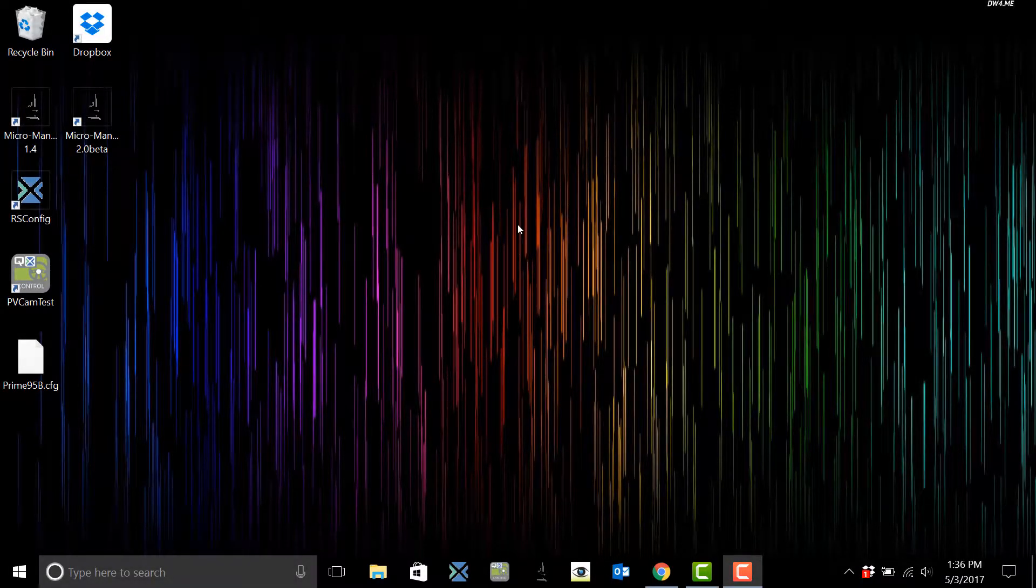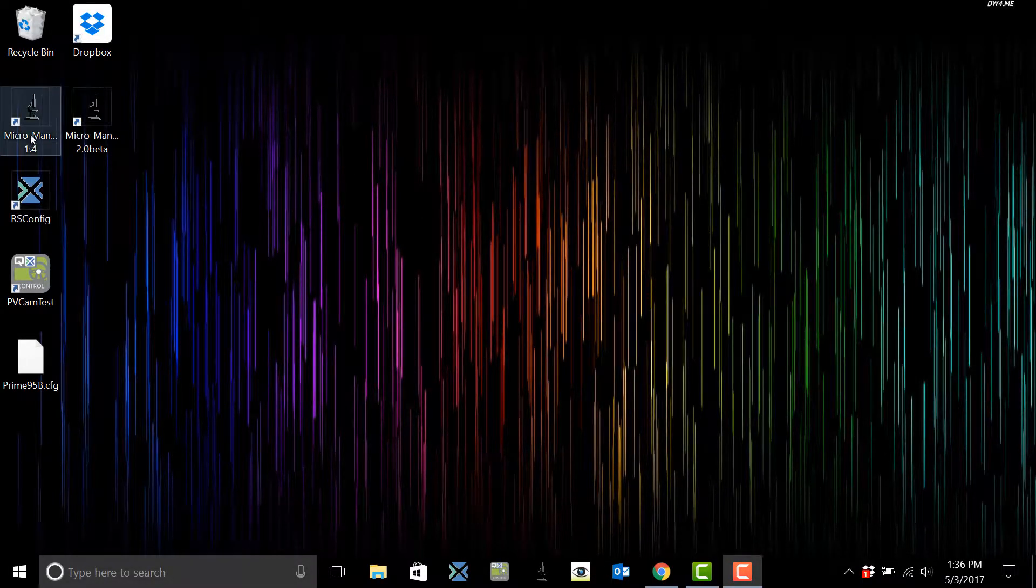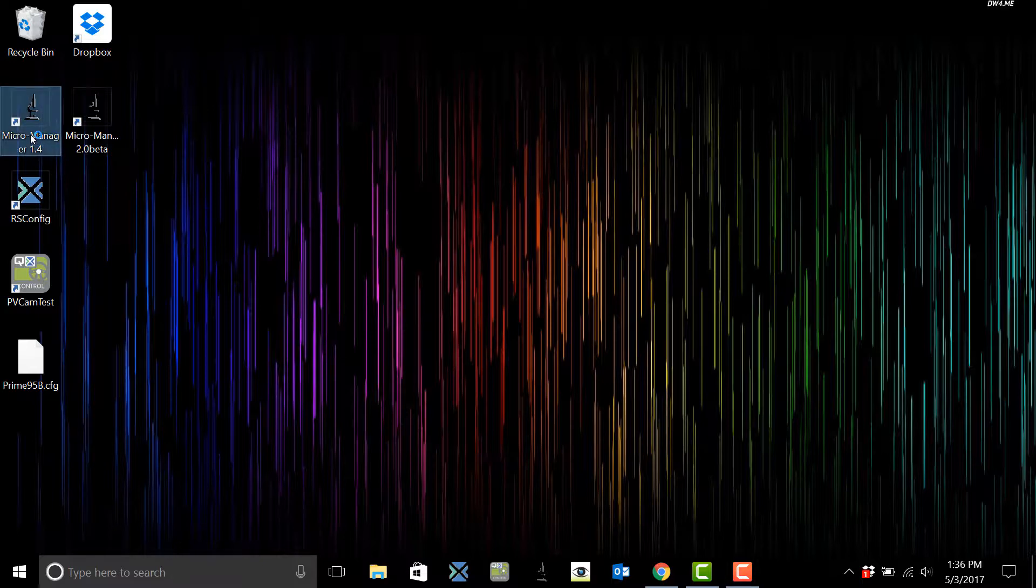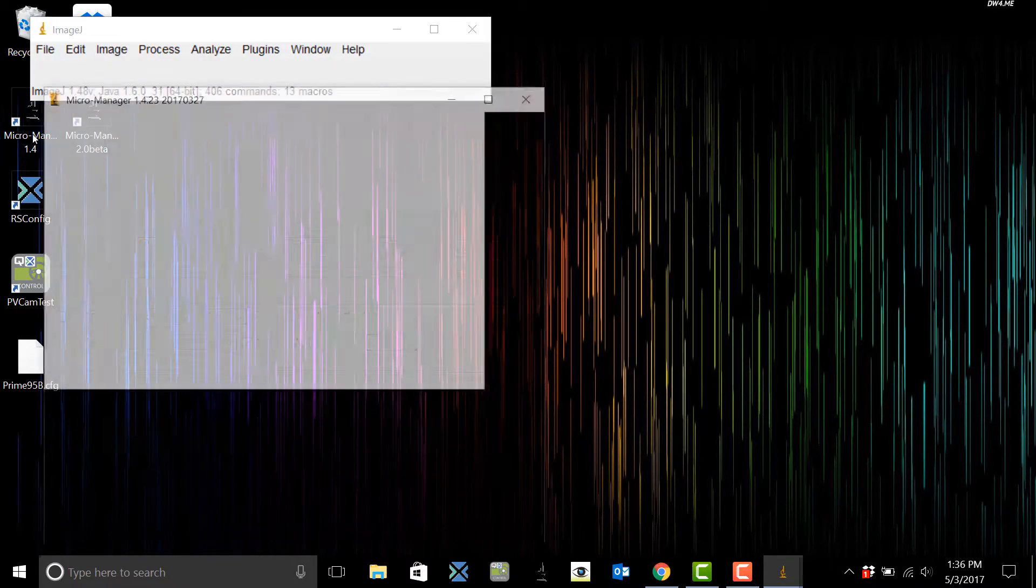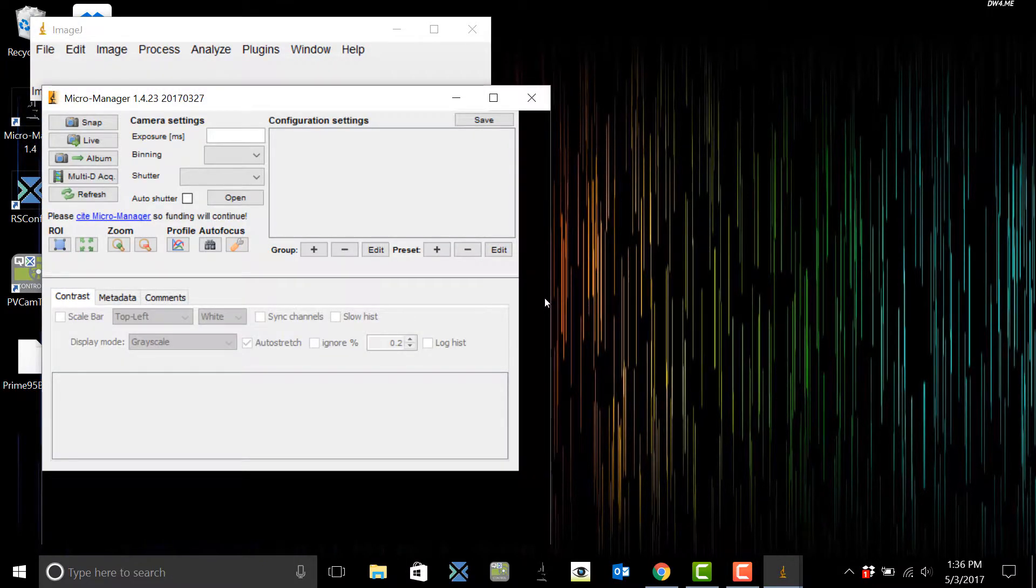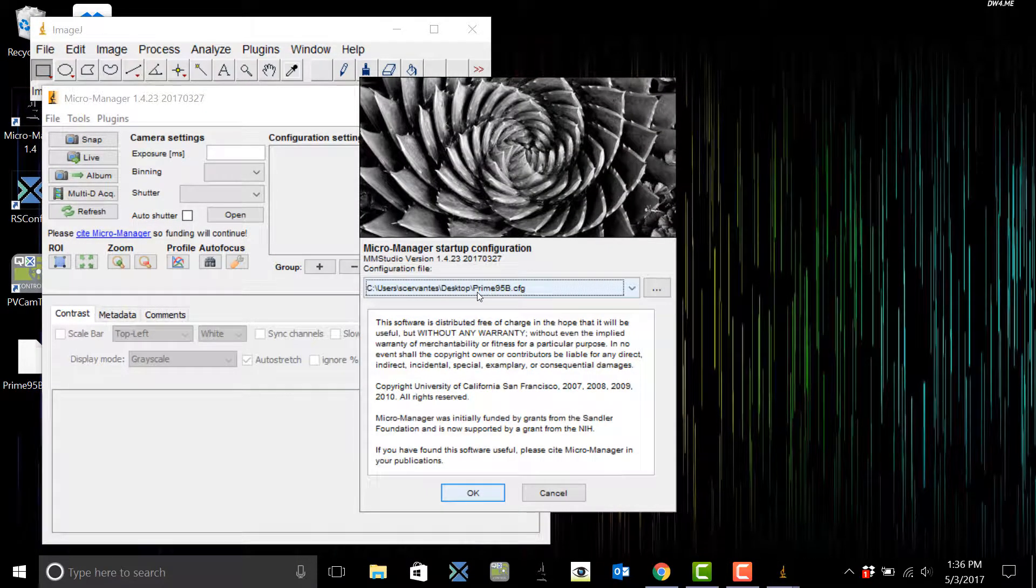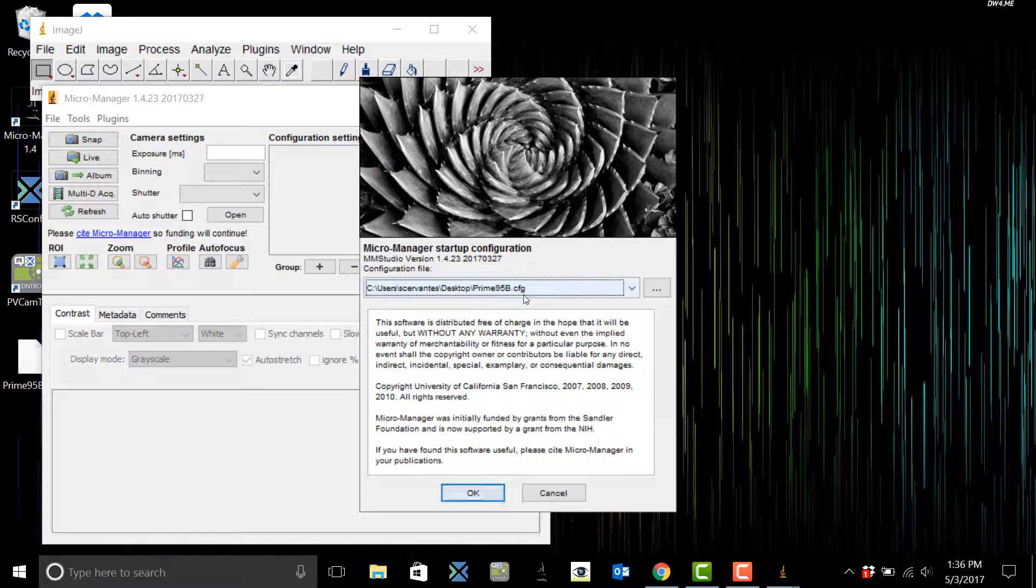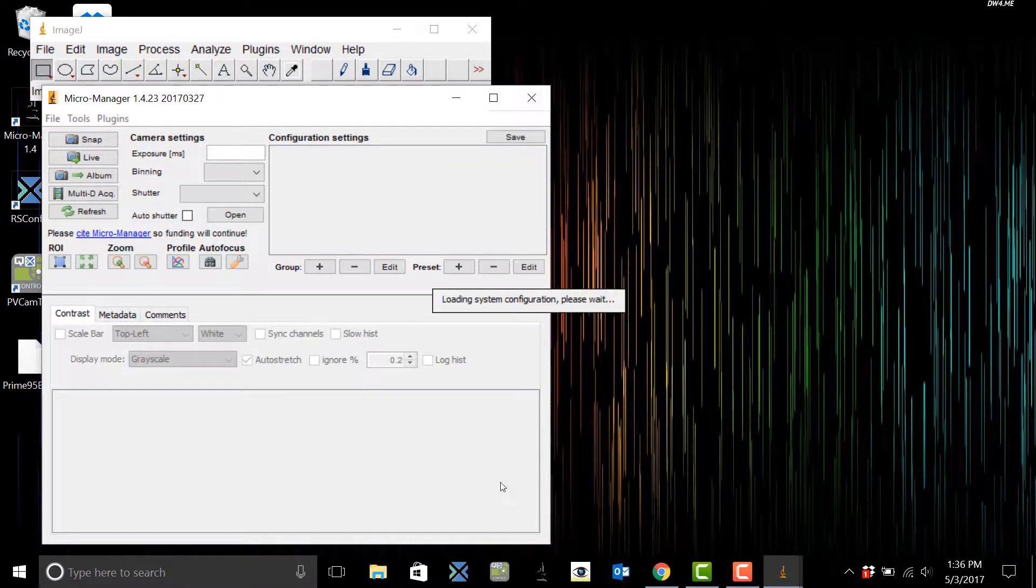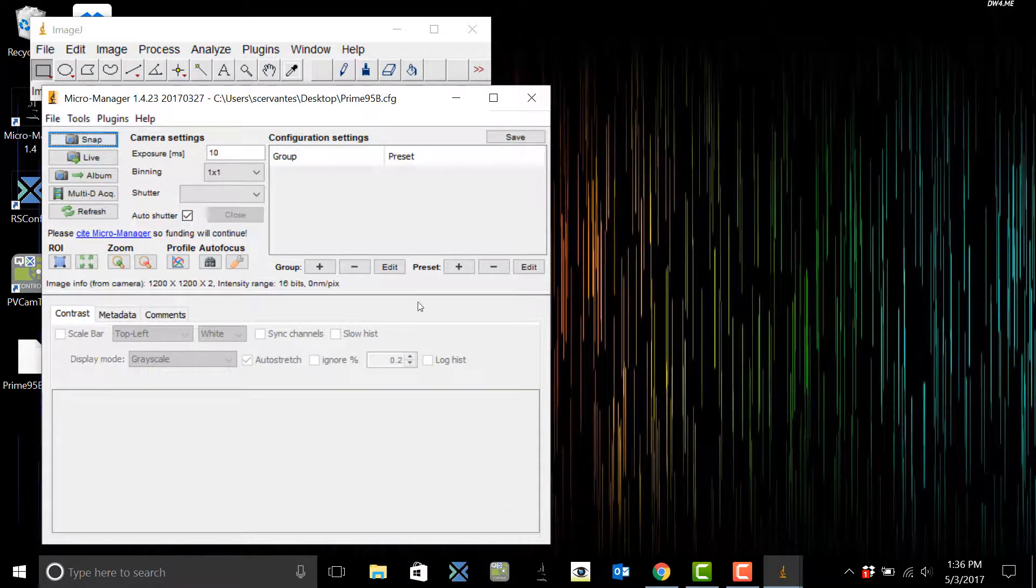This video is going to go over how to set up groups in MicroManager. So let's open up MicroManager and then we're going to select Prime 95B camera configuration and hit OK. Now to add groups you're going to come to Group and hit this plus sign.